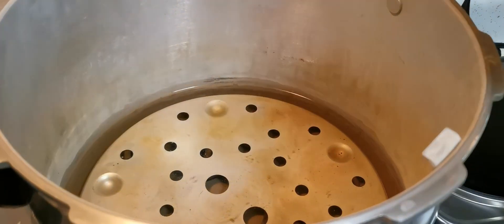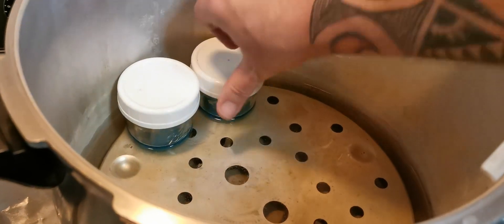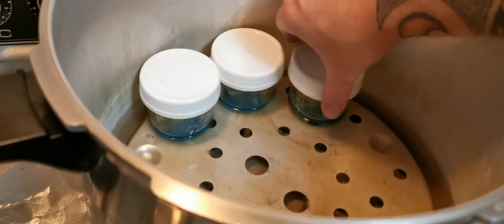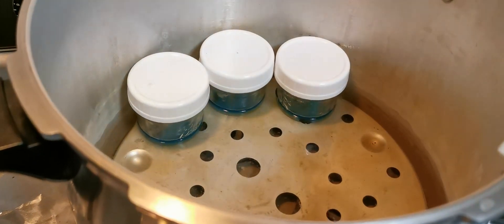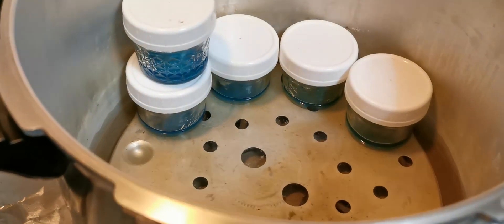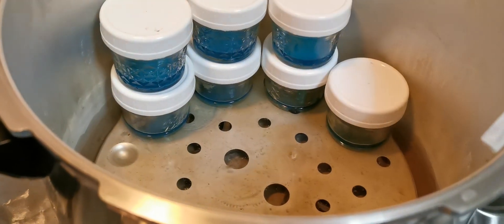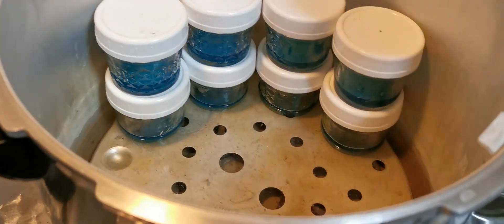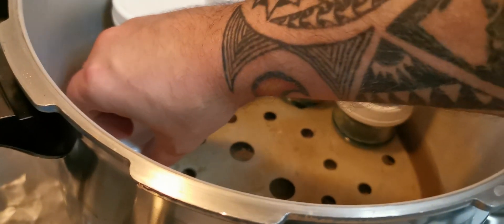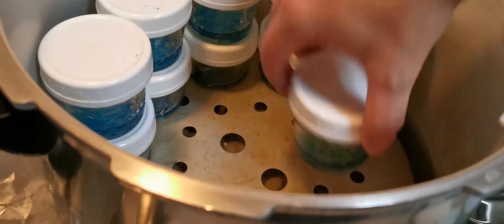Once we've got all our jars lidded, we're going to add them to the pressure cooker. You want your water level to be pretty low on the jars — if the water level is too high, it'll find its way into the lids and your bottom layer of jars will end up soupy. The best thing to do is to get a second lift. I like to preheat the pressure cooker while preparing the jars, as this speeds up the process of pressurizing.